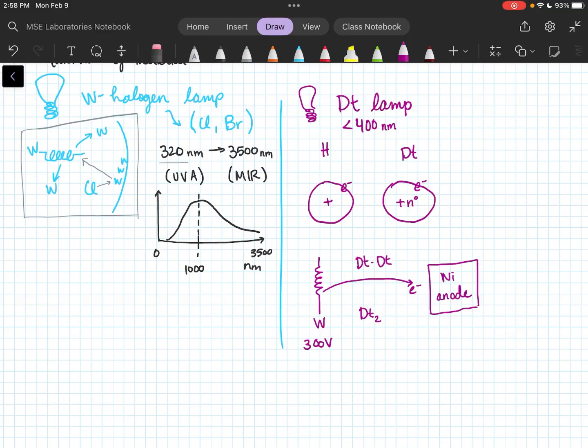This electron arc passing through the deuteriums, the deuterium will excite and then relax again. So the deuterium is doing a little energetic bump up and bump down as these electrons are passing through the gas. And that is what gives off the light, just that excitation of the deuterium getting excited and then relaxing. It gives off a wavelength of light. So it's the deuterium itself giving off a wavelength of UV light.